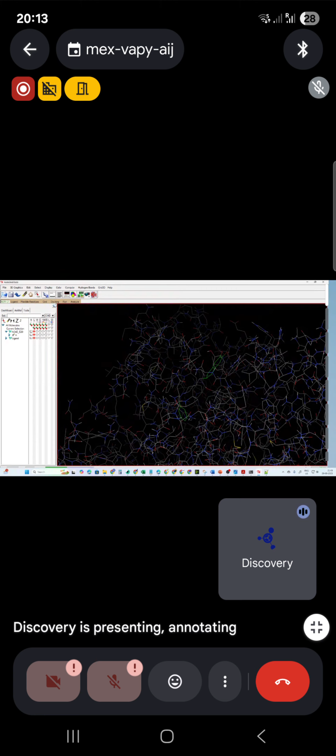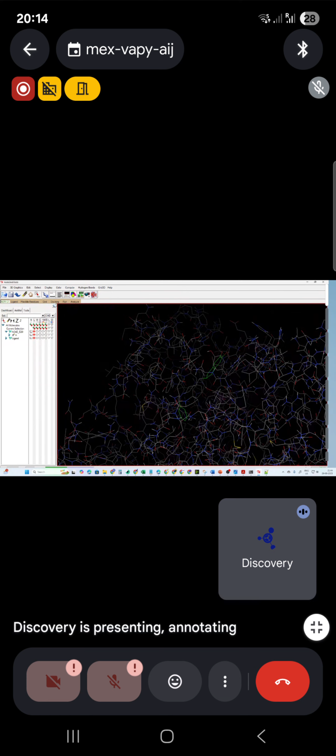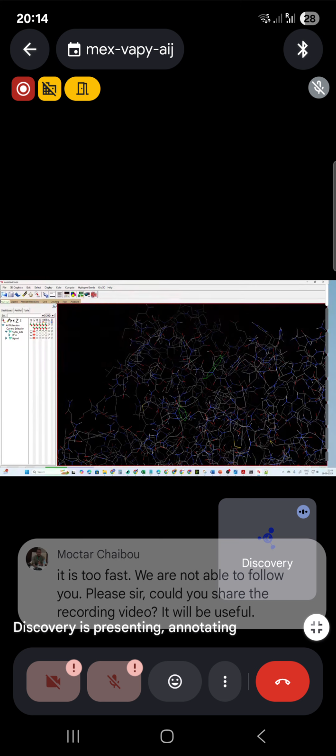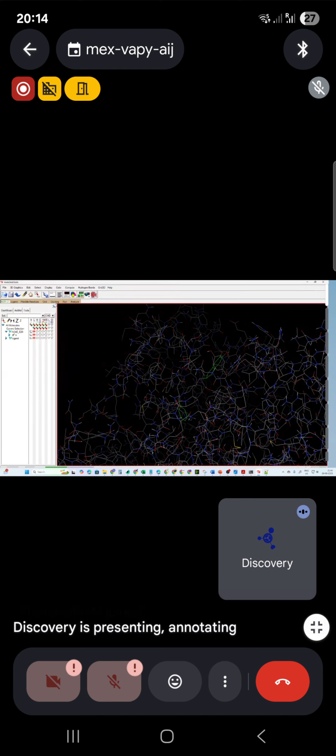So that's why we are removing the water, because it will be some kind of dummy atoms present. It doesn't contribute to the docking condition. Sometimes it will block the ligand also. If the water is present, unnecessarily we'll also be calculating the presence of water, but it doesn't contribute to the final score, okay?